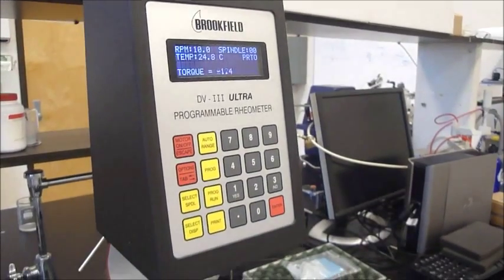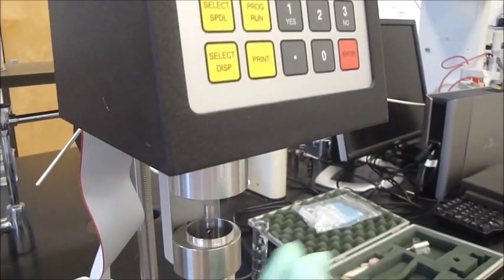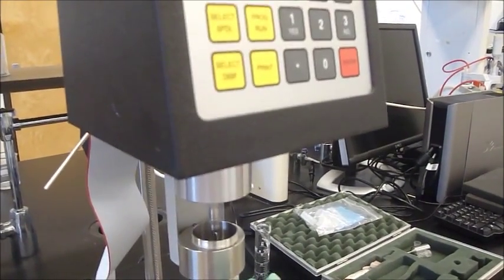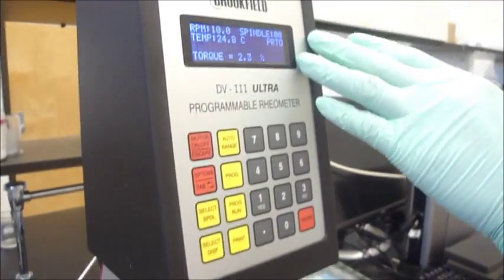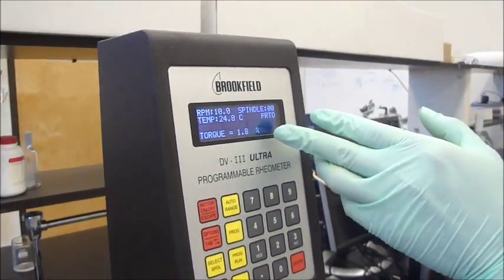So the spindle will rotate at a speed of 10 RPM. And on the screen, you can see the torque here.